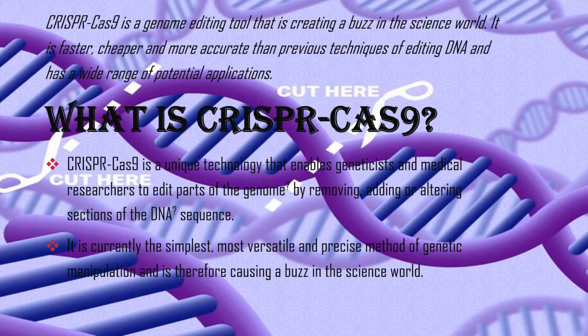CRISPR has the potential to revolutionize gene editing. CRISPR is a novel tool in gene editing that allows the modification of genetic DNA at specific target sites in many different organisms. In this project, we will use CRISPR to mutate a DNA sequence ourselves. We will not cure a genetic disease quite yet, but we will modify the genetic DNA of the bacteria.